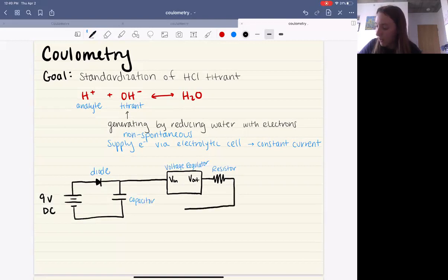And what we do is loop it back around, right back into the same voltage regulator, and that's an adjusted voltage now. Now that it's gone through that resistor, now we have a different voltage amount. Okay, and that adjusted voltage is going to go right back out again and through the resistor again, and so forth. Now, the voltage regulator that we're using in this experiment is designed specifically. It is programmed to do one thing. It takes whatever voltage comes in and it spits out one voltage going out. And that exact voltage that it's always going to spit out is 1.25 volts.